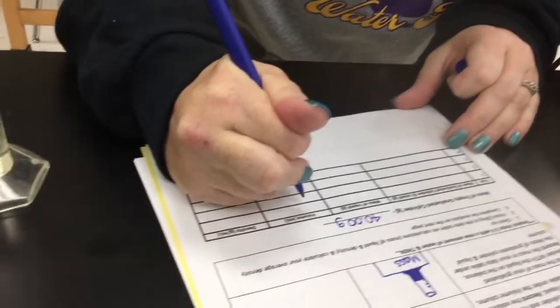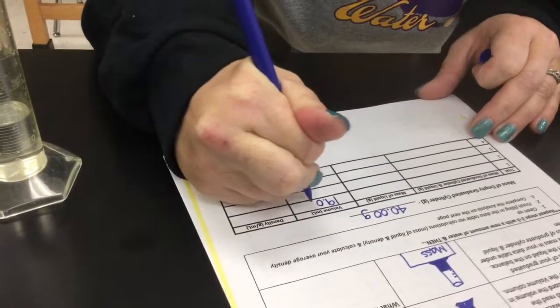Do I write that in my data table? Oh, I write that volume in my data table? Mass of graduated cylinder. Oh no, yeah, volume. Right here, 19.0 milliliters.